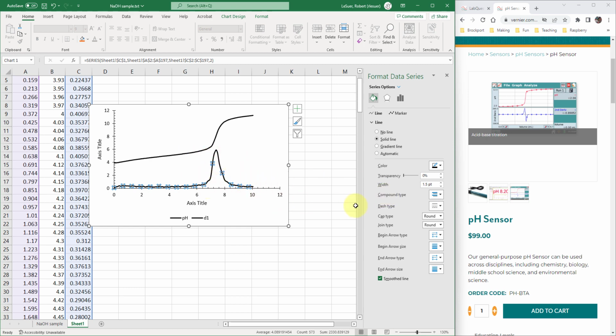So for the first derivative plot, I will change the dash type to, again, here it's whatever your preference is. Sometimes, depending on the number of points in the trace, some will look better than others, but as long as we can differentiate between the two, we are fine.